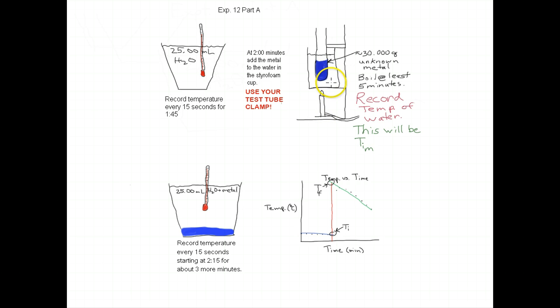Once it starts boiling, wait five minutes. What you need to do next, before you do anything with the metal, is record the temperature of the boiling water. Now, I know it should be about 100 degrees, but it probably won't be exactly 100 degrees. Put your thermometer in there, measure it to the nearest tenth of a degree. Record that.